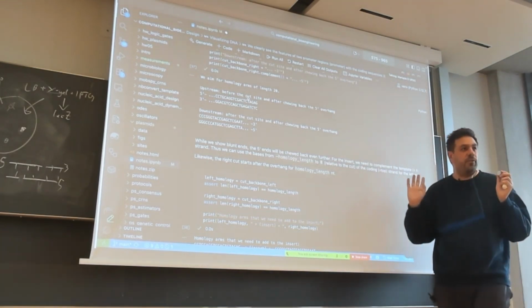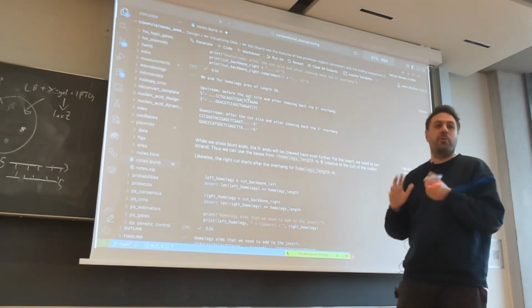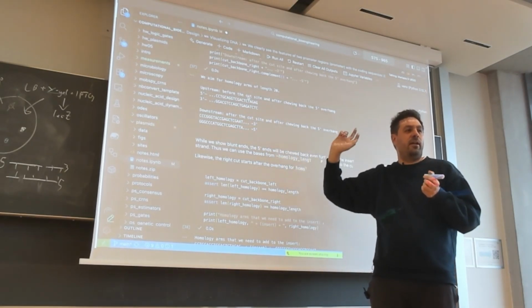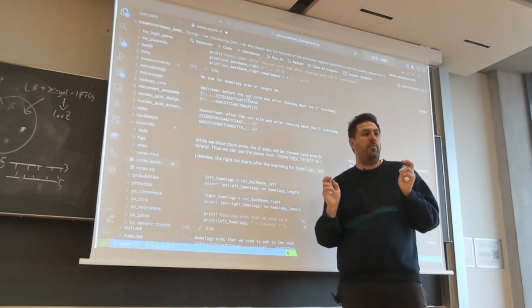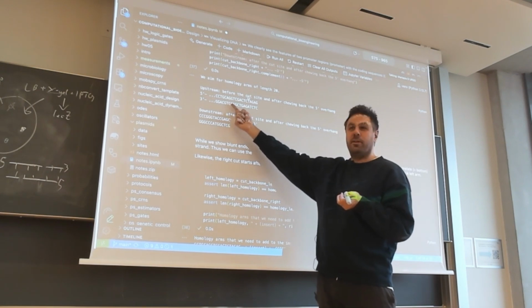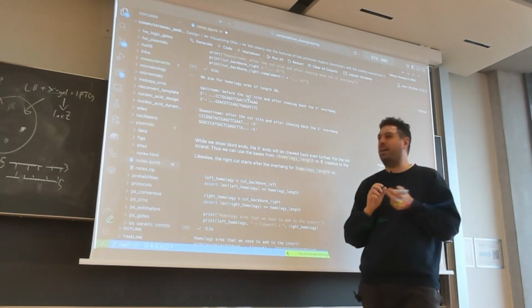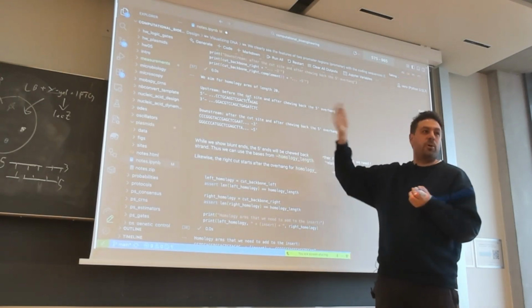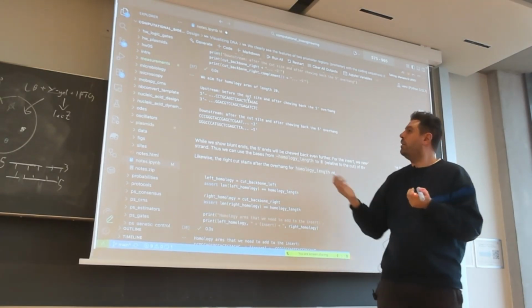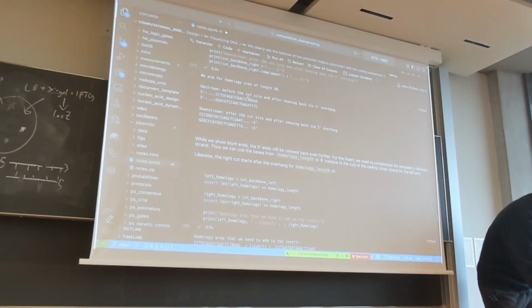Again, I cannot point this out enough; perhaps this is the thing about this lecture: write it as code. Of course, I could have just copied that with a mouse, copying 20 of this, and it's done. It's seemingly easy and perhaps even quicker at first. But who tells me that my mouse shouldn't have gone until here or here? Or imagine you want to cut afterwards not with BamHI but with EcoRI. You have to select it again with the mouse. I think write everything with code. And we did this here.